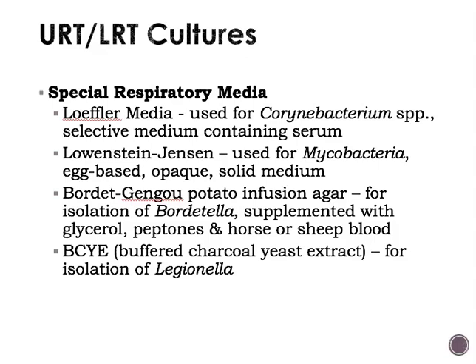And then BCYE, or buffered charcoal yeast extract. This one is used for isolation of Legionella. So some of these organisms that might be a little more finicky and require some additional growth requirements might require some specific media.